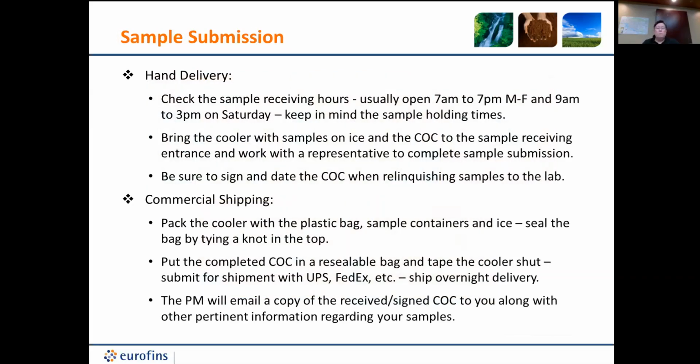Hand delivery, we're normally here 7 a.m. to 7 p.m. Monday through Friday, and we're here on Saturdays, 9 a.m. to 3 p.m. Please keep in mind the sample holding times when you're looking to bring samples into the lab. We'd like to get them as quickly as we can. Again, we tend to get, when it rains, a lot all at once.